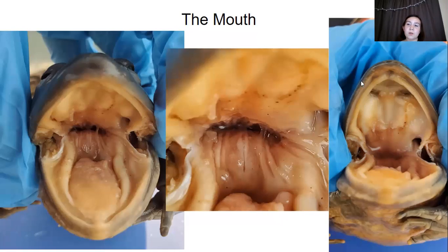So right here, this is the top jaw of the frog, but specifically this line right here, those are actually small little teeth of the frog. And these type of teeth are the main teeth that are used for chewing. They're called maxillary teeth. So when a frog finds its food, it's just going to chew with this.